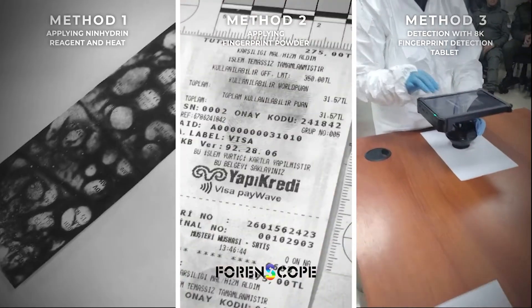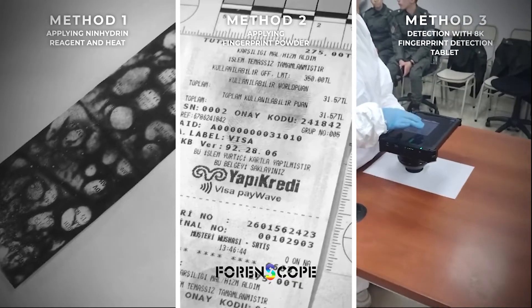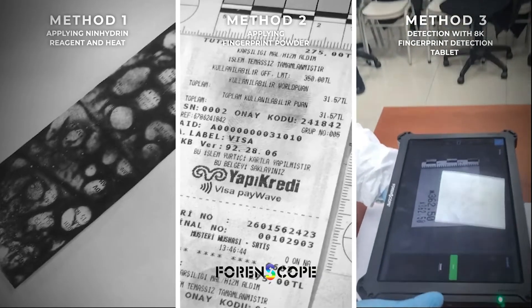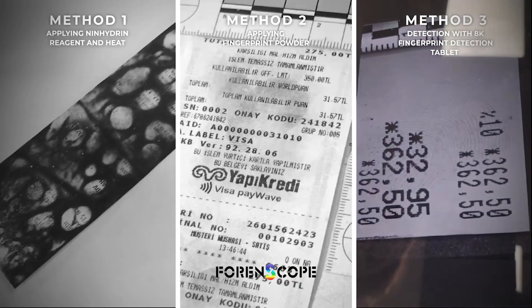This method includes using multispectral lights of Forenscope's 8K Latent Fingerprint Detection Tablet. Making detection with a multispectral evidence imaging device does not require any physical or chemical enhancement. The investigator can detect, examine, and capture the fingerprint easily.